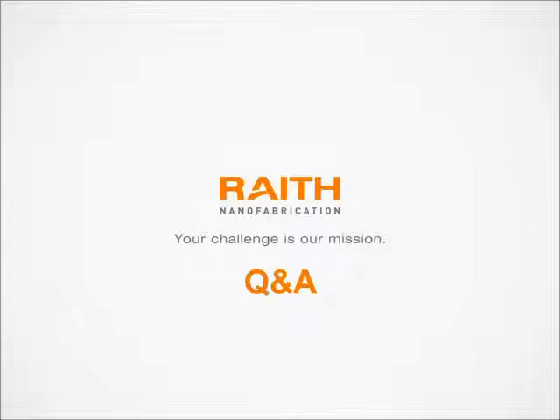Okay, thank you. The next question, how do you compensate for drift in the scanning EM? Okay, drift. Yes, when you are collecting images over long time frames, any scanning electron microscope will drift, and the chip scanner is a scanning electron microscope, and it's impossible to build a microscope that doesn't drift. So this is a common problem for electron beam lithography as well, and so we really understand the problem well.